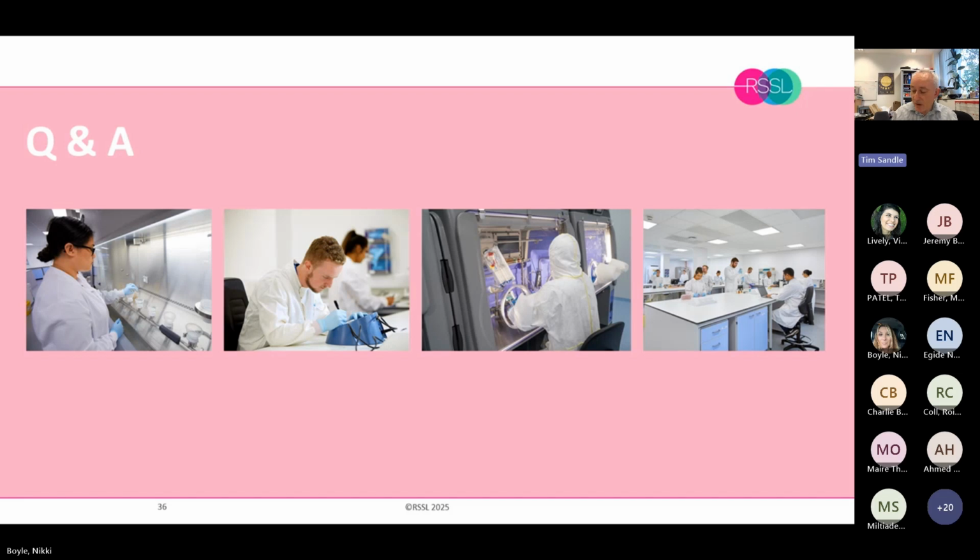So you need to be able to defend it, to say, I've used 6 organisms in my disinfectant efficacy testing, and here's my profiling, and I believe the 6 I've used are broadly representative and a suitable challenge of what's really out there. You've always got to keep connecting this validation to the real world, otherwise it all becomes pointless. Absolutely. Okay, well, that's really helpful.